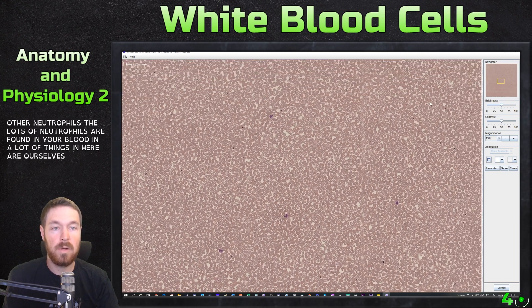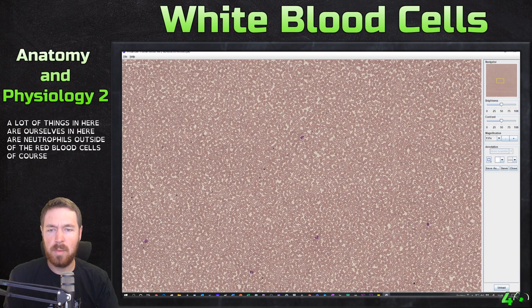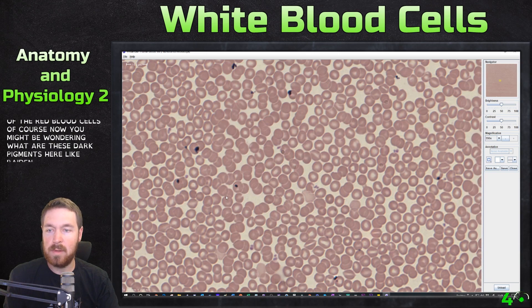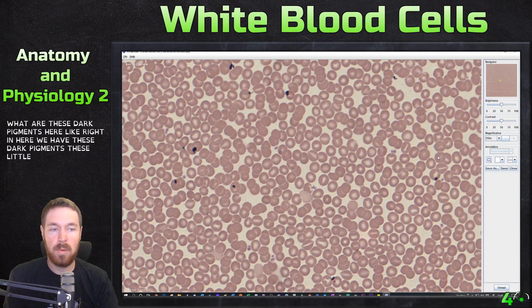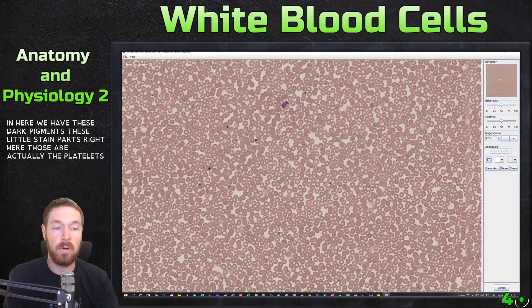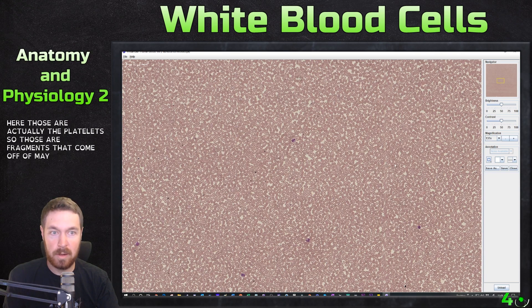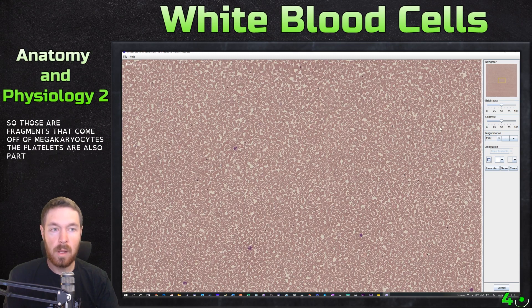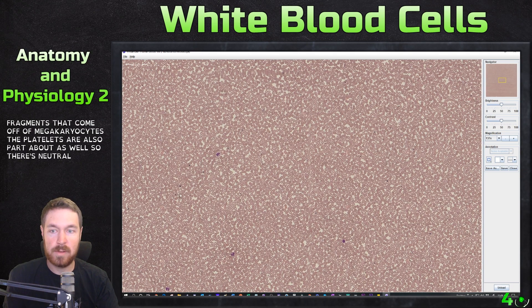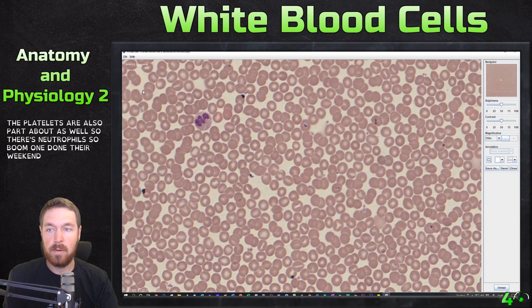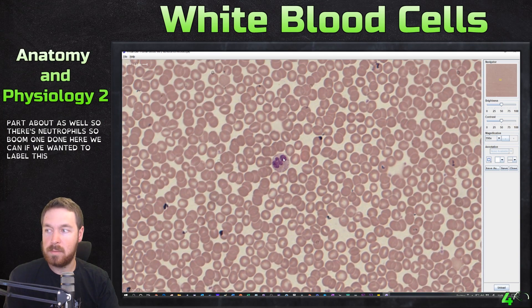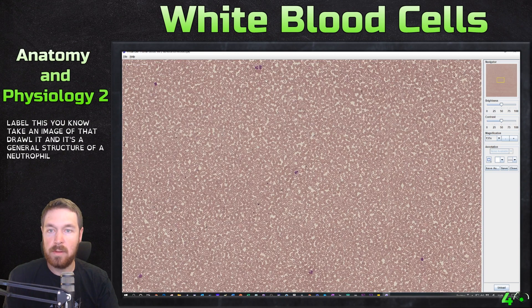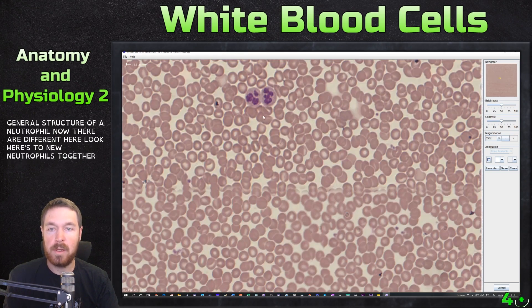Lots of neutrophils are found in your blood — most of the cells here outside of red blood cells are neutrophils. You might be wondering about these dark pigments right here — those are actually platelets, fragments that come off of megakaryocytes. So we've found neutrophils; you could take an image, draw it, and that's the general structure of a neutrophil.